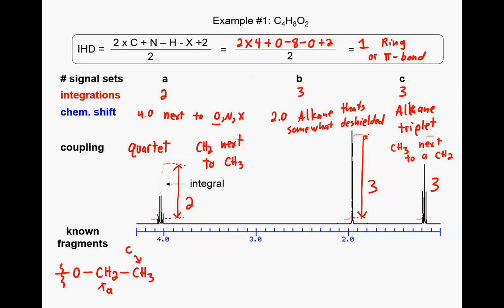What's the coupling? What's the splitting on this? It's just a singlet. So how many neighboring protons does it have? 0, right? So it's n+1, and if it's got 0 neighboring, it's got 0 plus 1, so we've got a singlet. All right, so what do you think a signal that has 3 protons that's not next to anything, what kind of motif do you think that is?